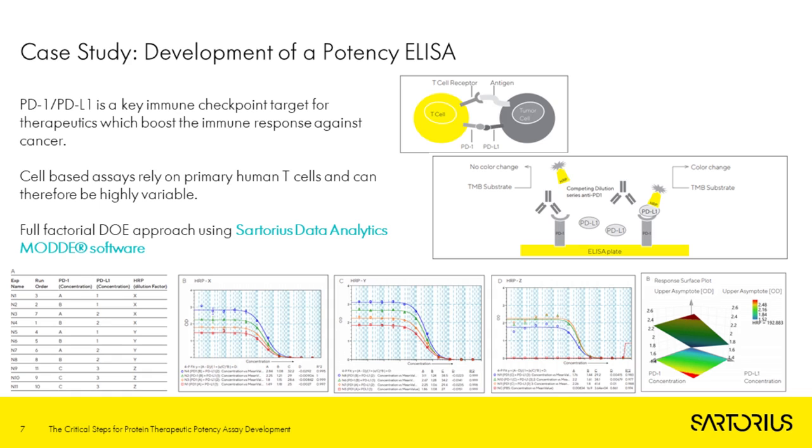So I'd like to share a couple of case study examples of potency assay development from the Sartorius labs. These were performed as internal studies as part of our platform assay development, where we develop a platform method and then evaluate it with commercially available suitable drugs. And the first is the development of a potency ELISA.